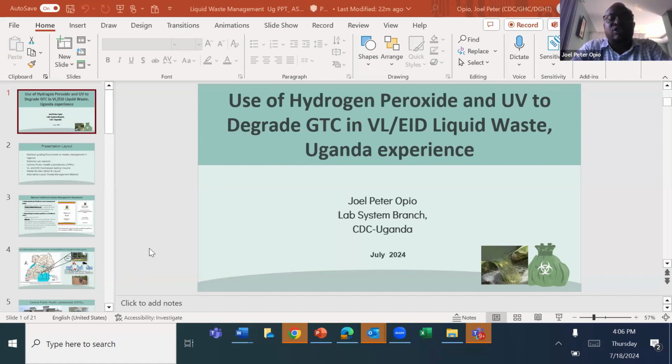My name is Joel Peter Opio. I work with CDC Uganda as lead in the lab system branch. And I'm happy to share with you Uganda's experience in the use of hydrogen peroxide and UV light to degrade guanidine thiocyanate, what we normally refer to as GTC, in viral load and EID liquid waste management.